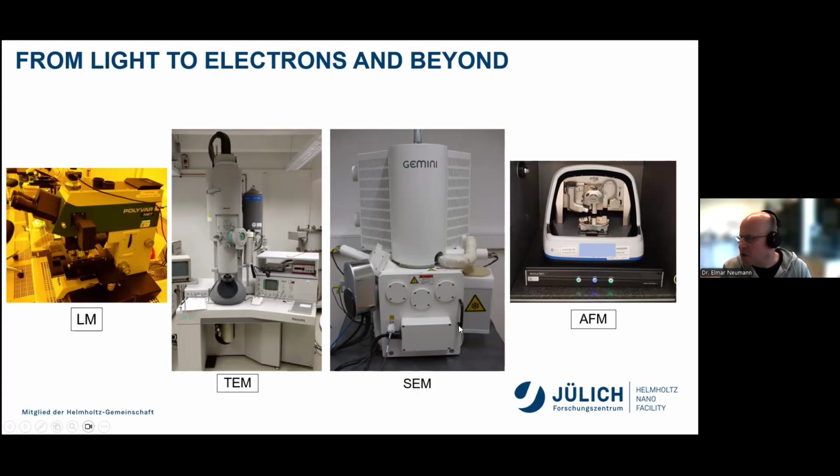This is an old SEM. You have a large column, again, what we were talking about. We have a large opening here for all kinds of samples and sample sizes, as well as a cryo transfer system. And this is a modern day AFM machine.